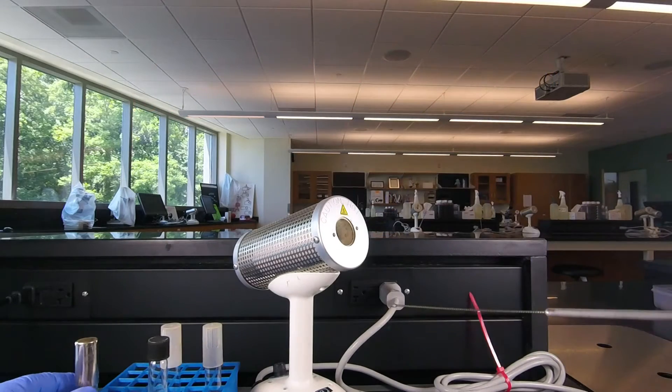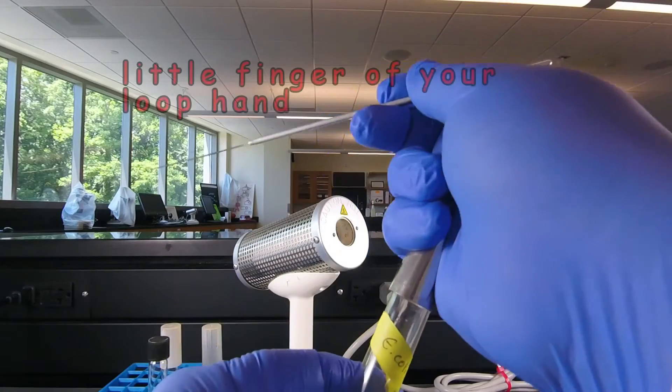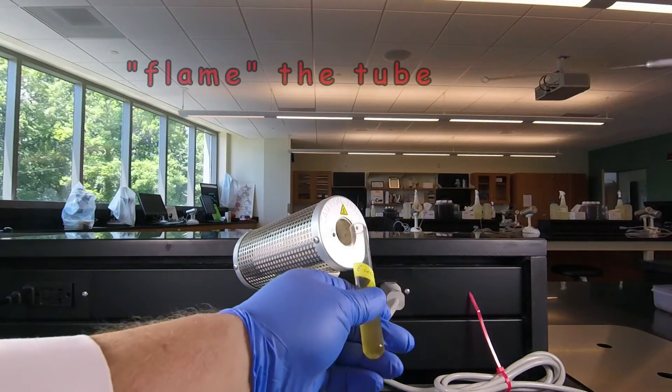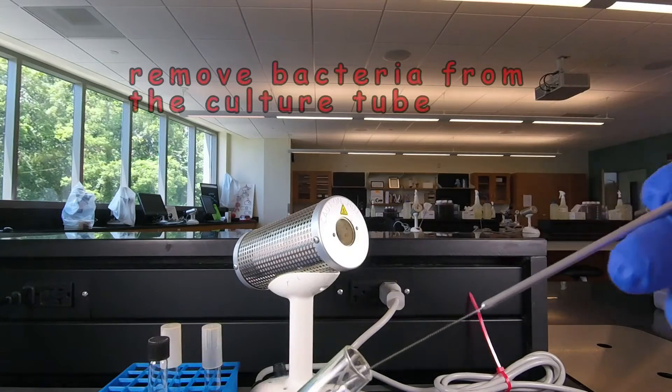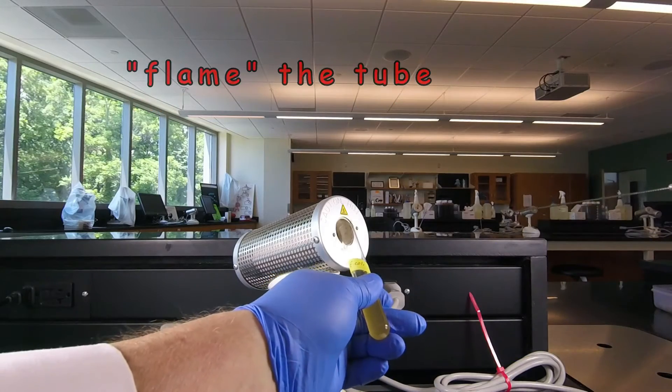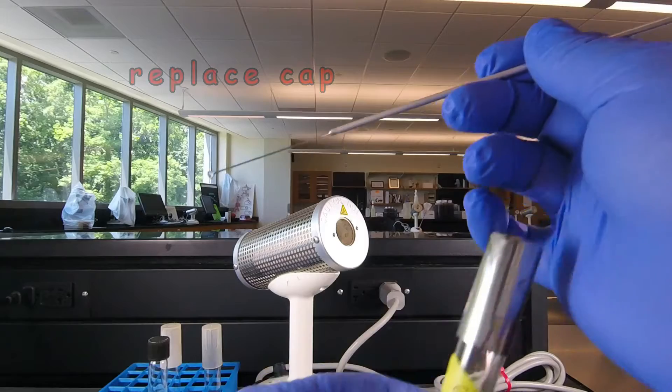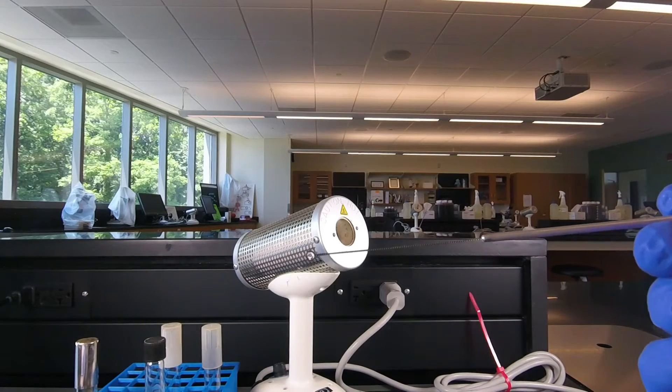Then we take our tube of bacteria. Now once again this is a tube of E. coli. We remove the cap with the little finger of the loop hand. Immediately flame the tube for three seconds. Remove a loop full of the E. coli. Flame the tube again. And put the cap back on. So now we have the E. coli on our inoculating loop.